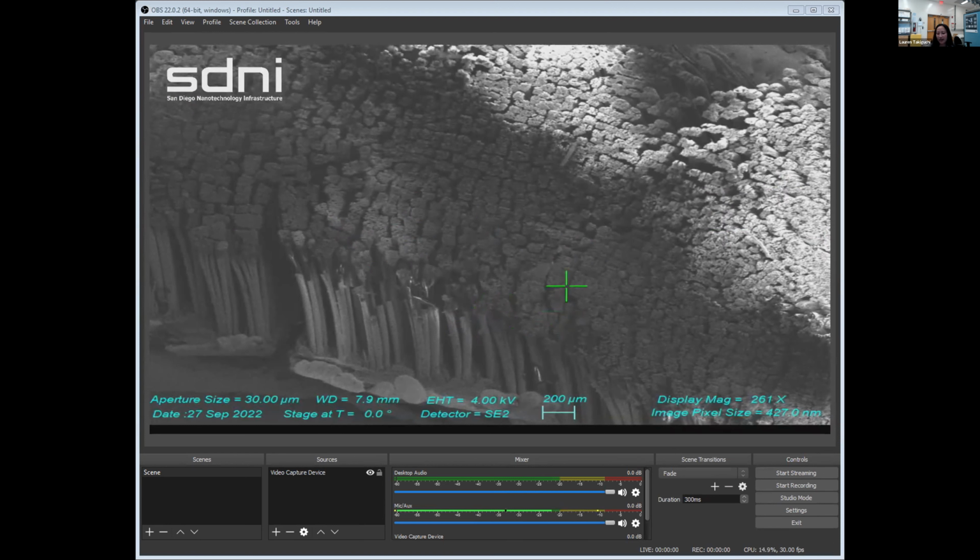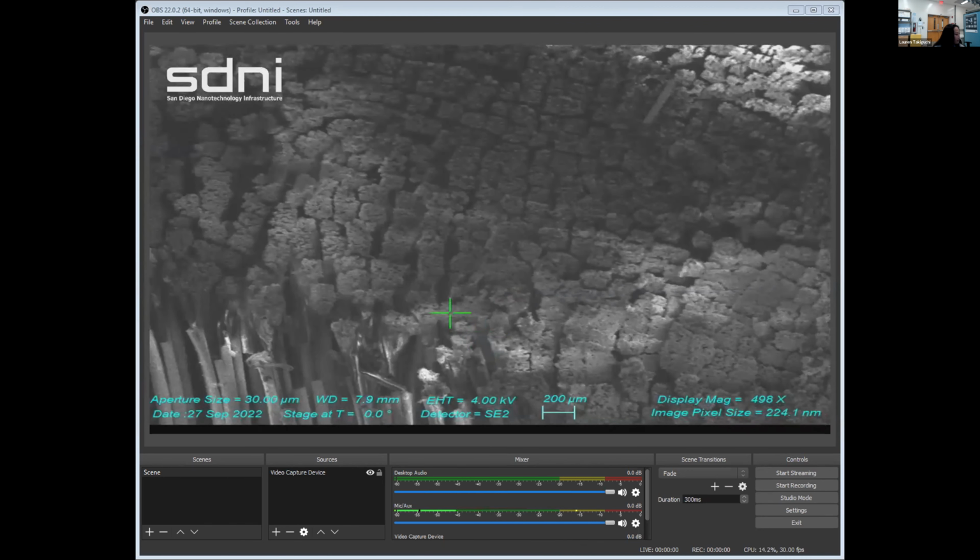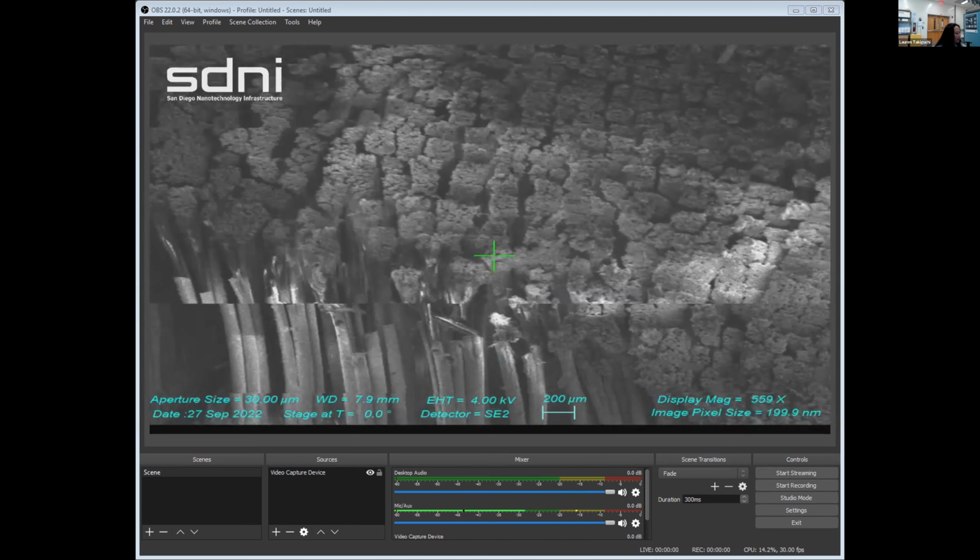And it turns out that because of these intermolecular forces that add up because of the large surface area that the gecko's foot covers, the force from the van der Waals attraction is 1,000 times more than what's needed to hold up the gecko's weight from just gravity. So that's pretty cool. So let's zoom in on an individual spatulae.